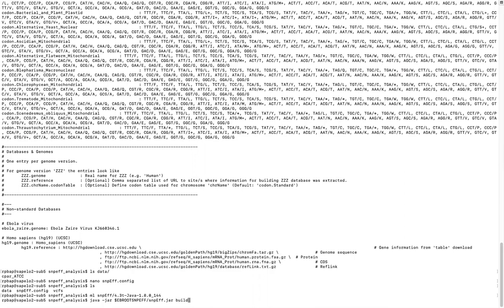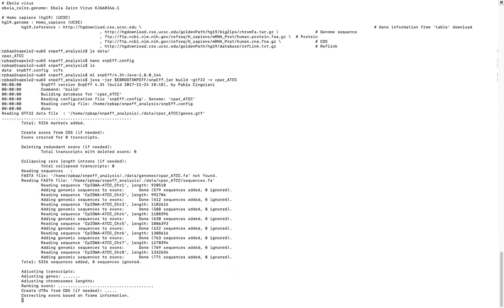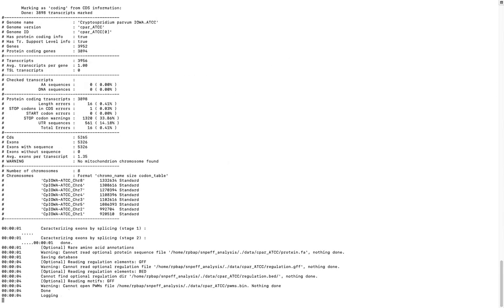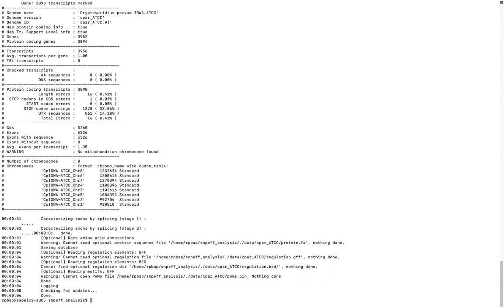To build the database, run: `java -jar $EBROOTSNPEFF/snpeff.jar build -gtf22 -v cpar_ATCC`. SnpEff goes into the config file, finds the `cpar_ATCC` database entry, then looks in the data folder to import the gene location and sequence information. We will also be creating the BIN file that was previously listed. Once complete, your database is saved and ready.